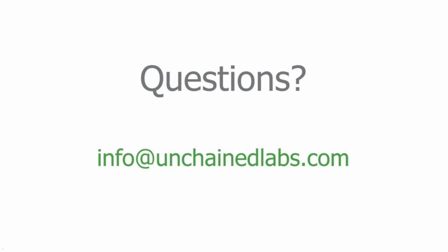Great, thank you. All right, this next question asks, can you use Uncle's DLS when looking at AAV stability? So Uncle's DLS is typically used before and after a thermal ramp for the experiments that I've shown today. And that's just run automatically as a way of checking what the quality of your sample is before running a thermal ramp, and to confirm aggregation through an orthogonal light scattering metric at the end of your thermal ramp.